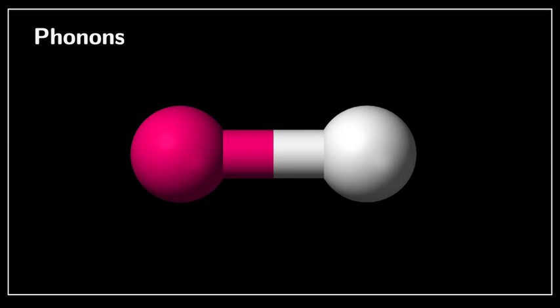using quantum mechanical approaches or classical approaches. But let me give you a rough idea of what we mean by that. So phonons and vibrations, here I use them interchangeably, even though we usually call them vibrations in a finite system like a molecule and phonons in a solid. So in the second screencast, where I will have applications, I will talk mostly about phonons instead of molecular vibrations.